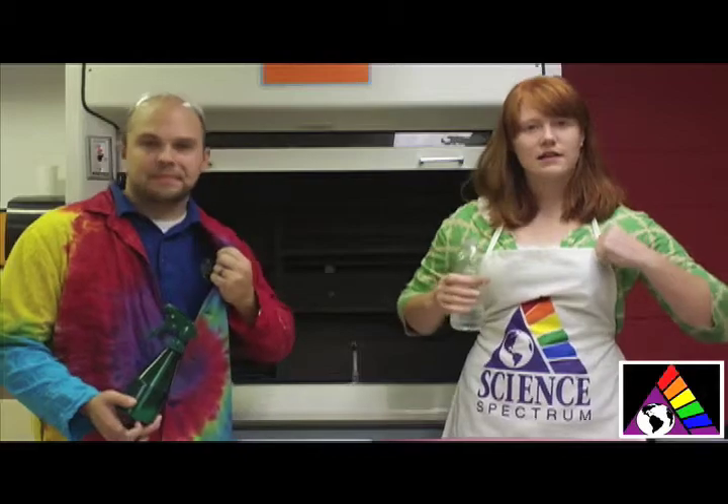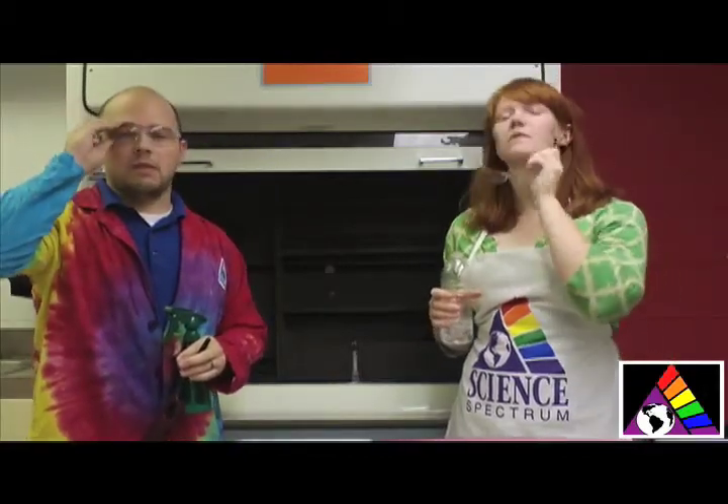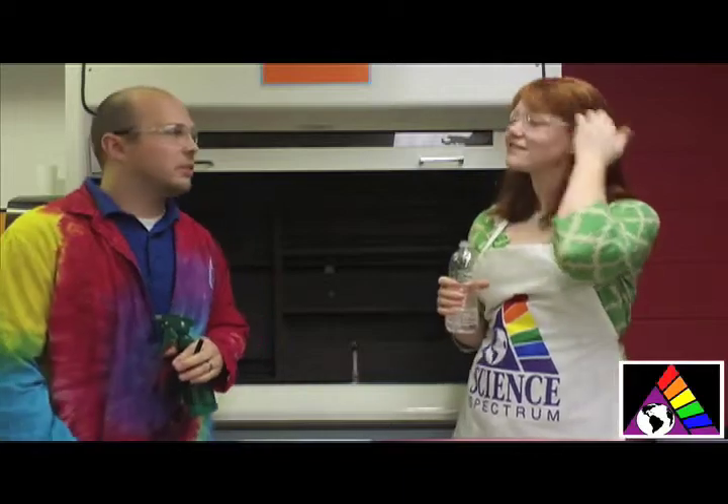The other thing that we're doing to be safe: I've got on an apron, Kevin's got on his nice lab jacket. We also have these handy-dandy goggles. We look super cool, don't we? We do — we look very cool.